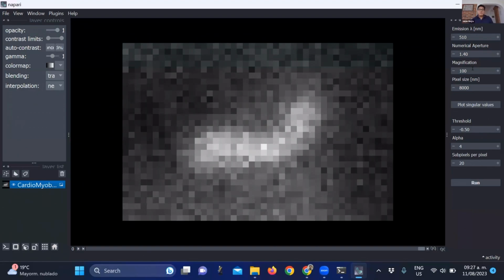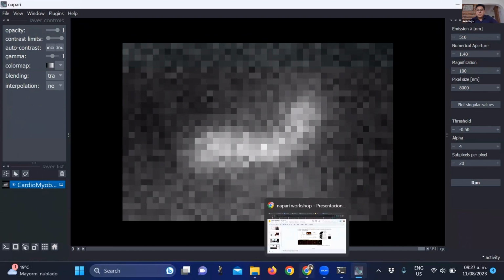But for instance, picture that you are later on or tomorrow and you want to play around with it because you find that it's somehow interesting. And then you come in here, and since it is not specified which magnification, you say magnification of what? Of my image, or the magnification that I want to set in this software? Then I would like to refer you again to our manual.